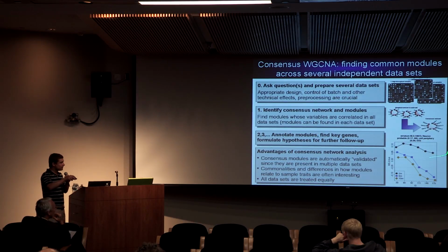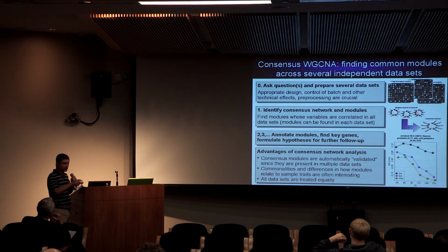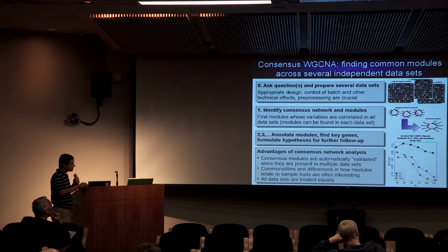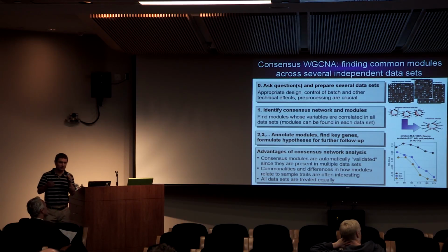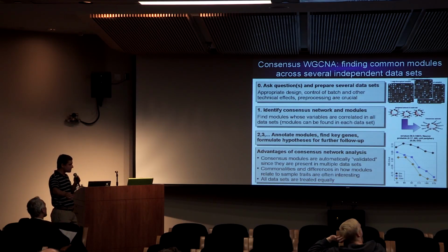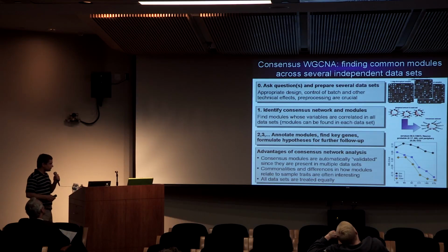You can, of course, figure this out for individual genes, but if you have 20,000 genes, it's kind of hard to interpret, whereas if you only have 10 or 15 or 20 modules, it's much easier. And the module analysis can tell you, okay, this module is enriched in neuron markers, and it's enriched in GO-term cell periphery. So there is something going on with neurons that at 2 months, nothing changes, but at 6 and 10 months, the expression of those genes starts to go down.